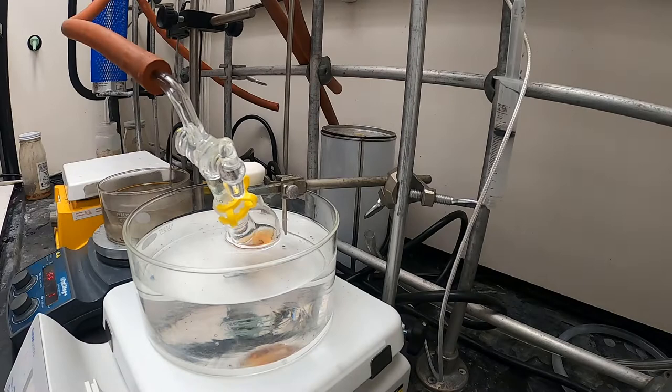To start the polymerization, I place the flask in a preheated oil bath. Typically, I'll initially have nitrogen flowing into the flask. This allows the pressure to equilibrate as the mixture heats up, and after a few minutes, I will close the stopcock to seal the flask.